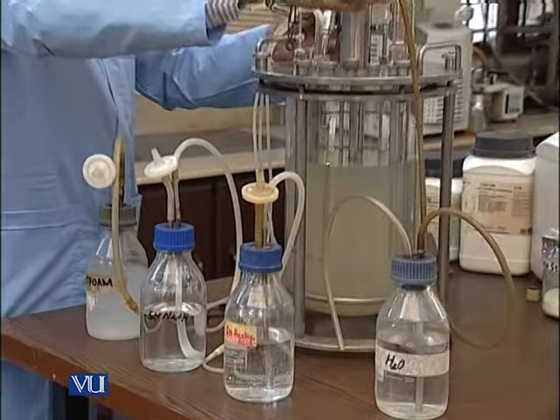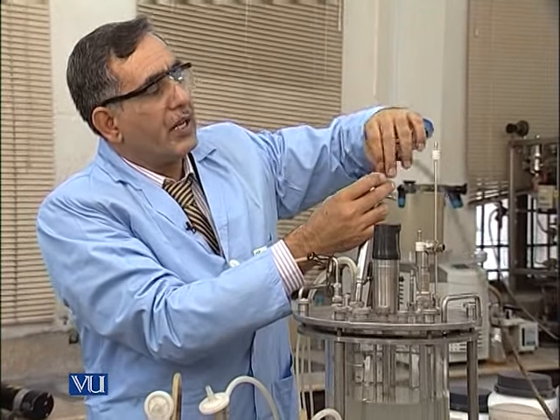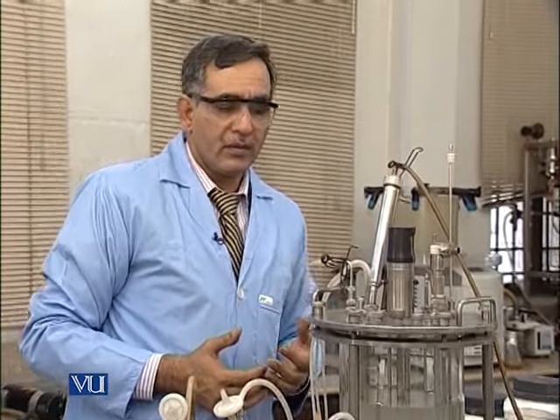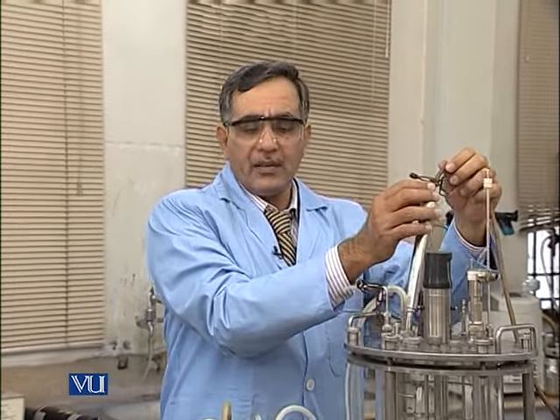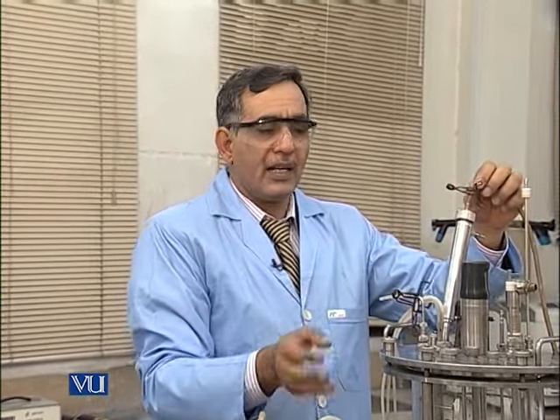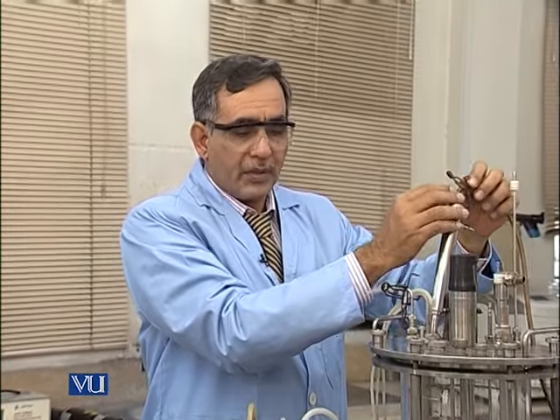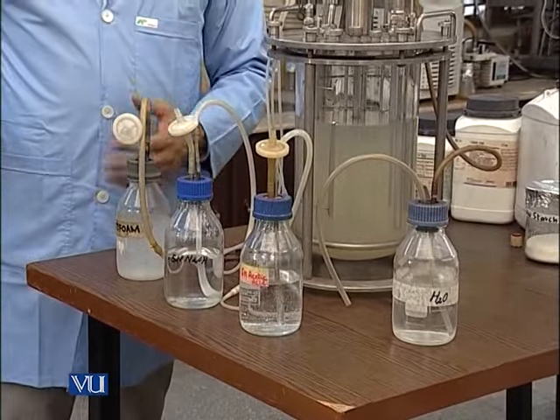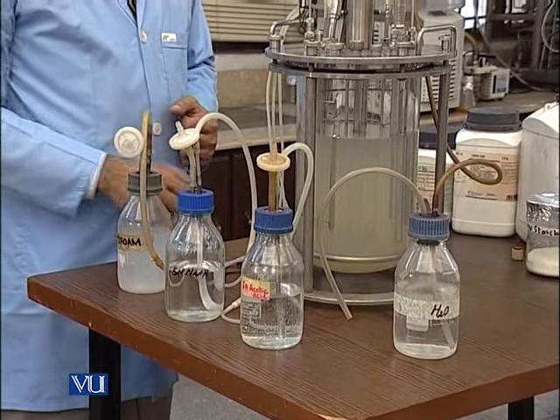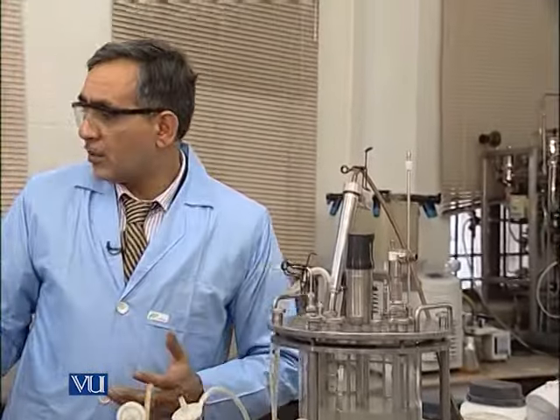So this water we will just attach on the top of the condenser, because sometimes when there is an electric shutdown and there will be a negative pressure inside, what happens? The air can come from the outside to inside. If we add the air filter here, then there is a bright chance of the choking of that filter due to the wet air. So as per my experience, we mostly attach this, so it will be sterilized along with this whole assembly inside that. So we will put this whole assembly into this autoclave.